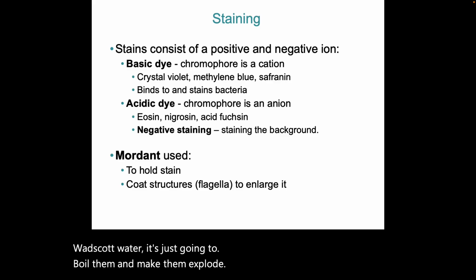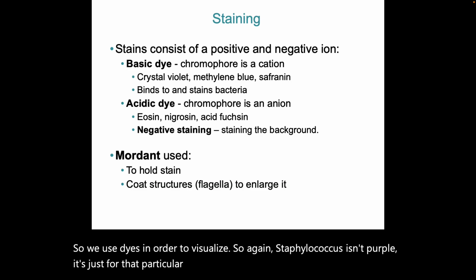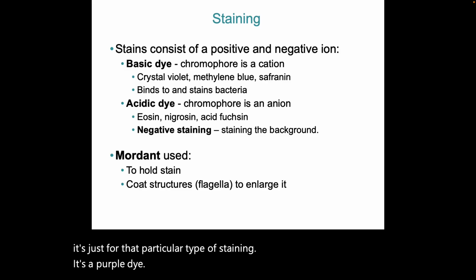So we use dyes in order to visualize. So again, Staphylococcus isn't purple, it's just for that particular type of staining, it's a purple dye. I can use any kind of dye I want. I can make it blue, I can make it pink.